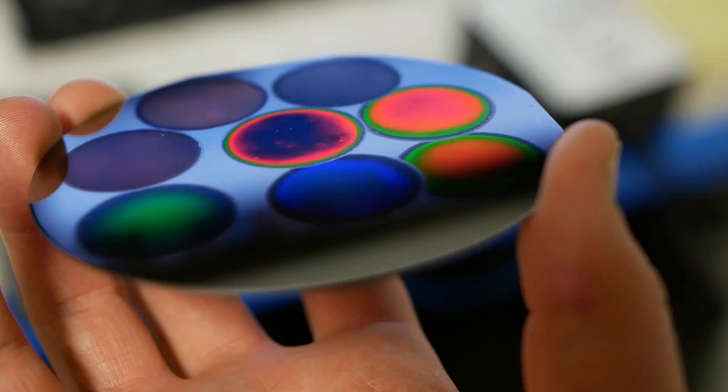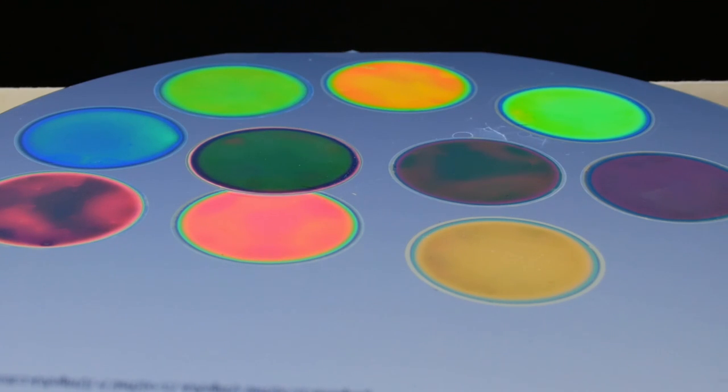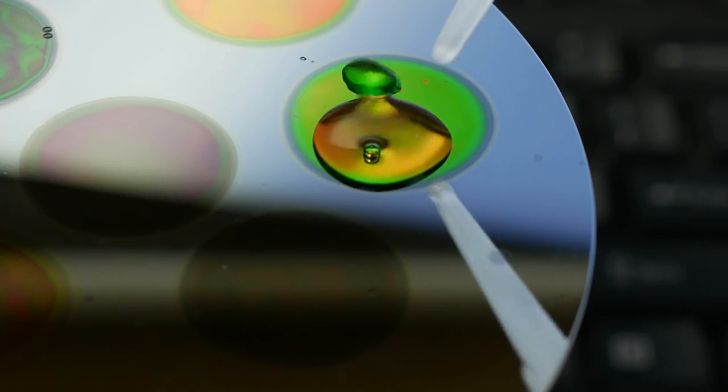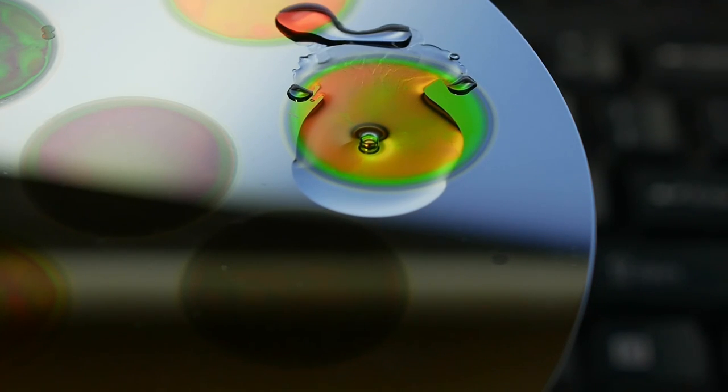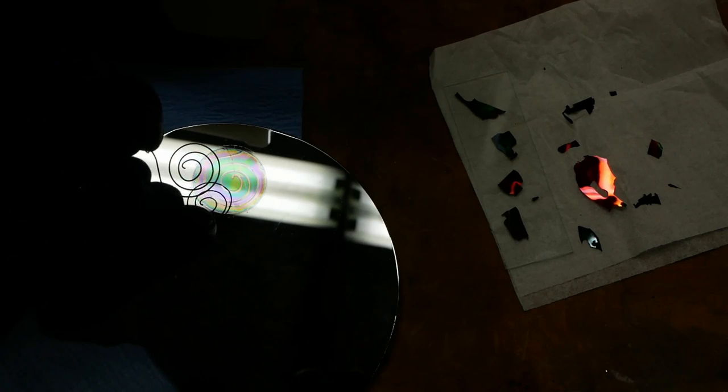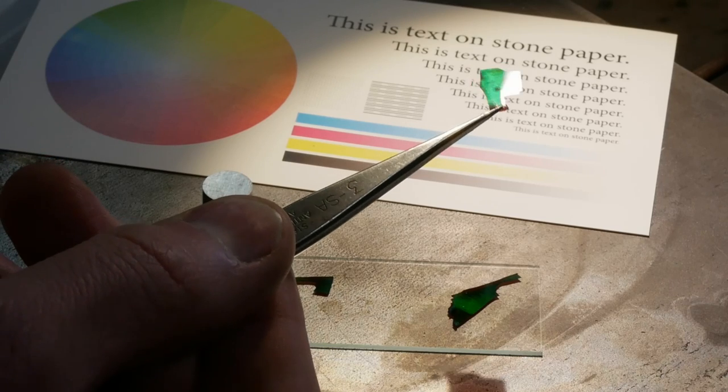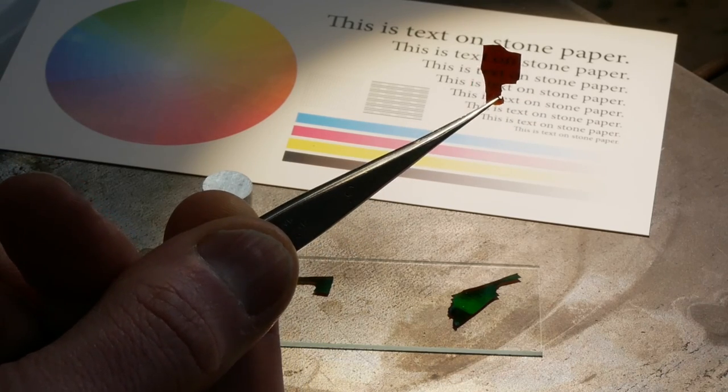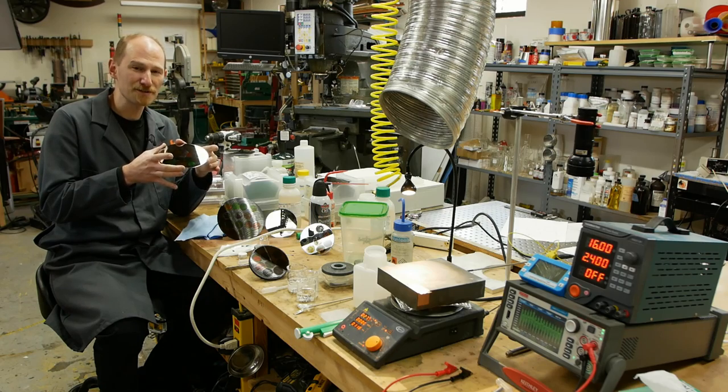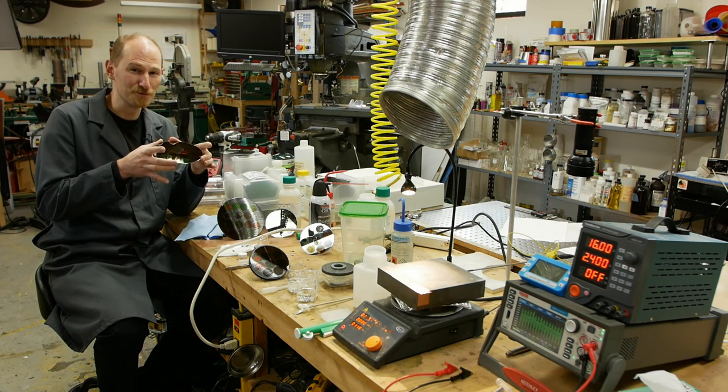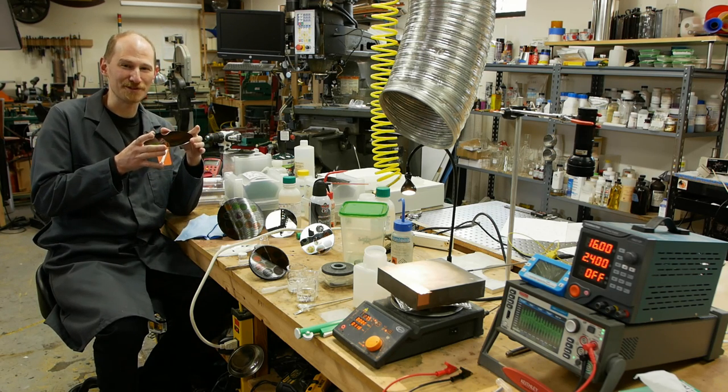These filters have a lot of interesting properties. The surface can even be functional, so we can use it as a chemical sensor, we can pattern the sensor using light, and we can even remove the filter from the surface of the silicon just by giving it a high current pulse, and then actually make a transparent filter. But this actually has one other property that's a true mind blower, let me show you.